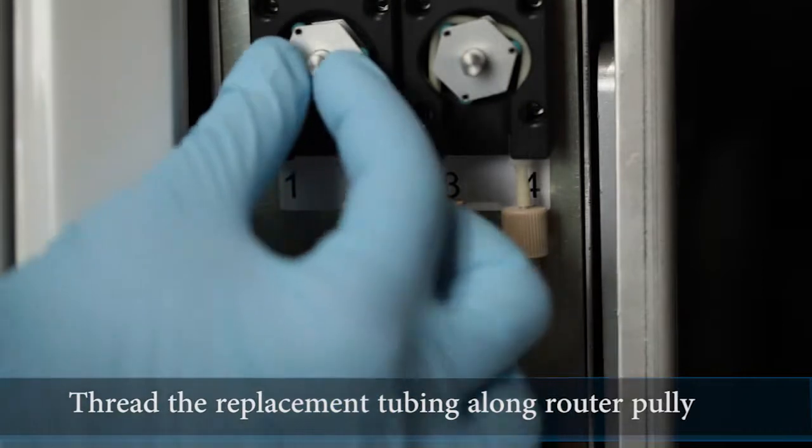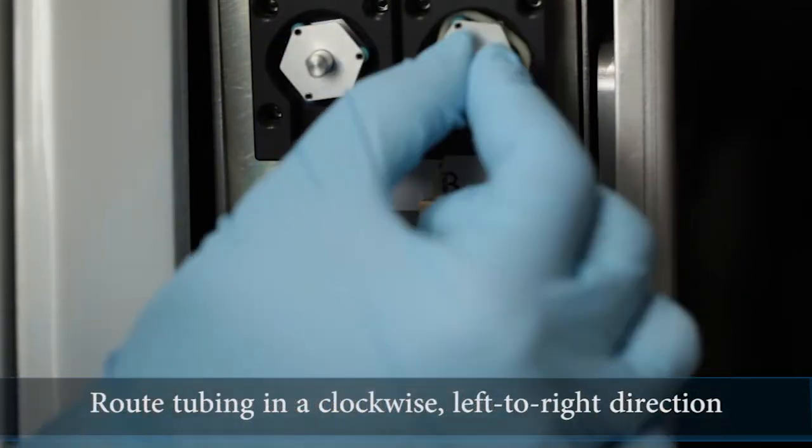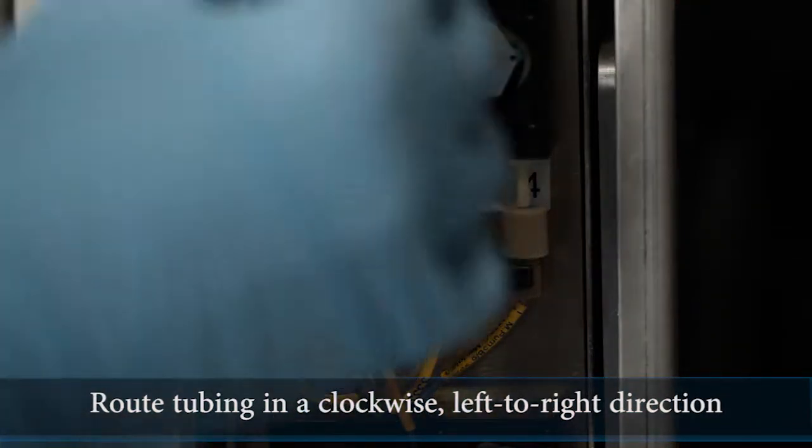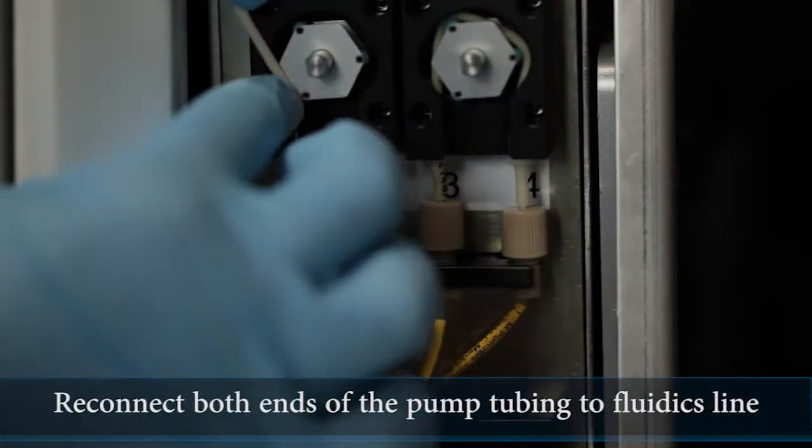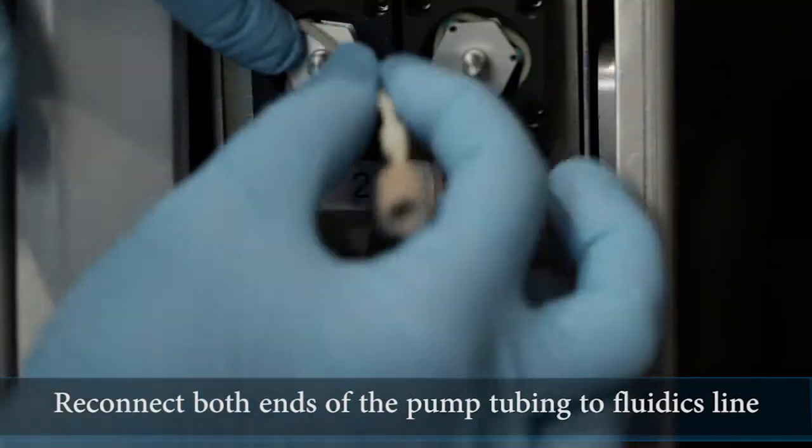Thread the replacement tubing along the router pulley, and route the tubing in a clockwise left to right direction to seat and position the replacement tubing. Reconnect both ends of the pump tubing to the corresponding fluidics line, making certain to match each end of the pump tubing to the correct line to prevent a malfunction.